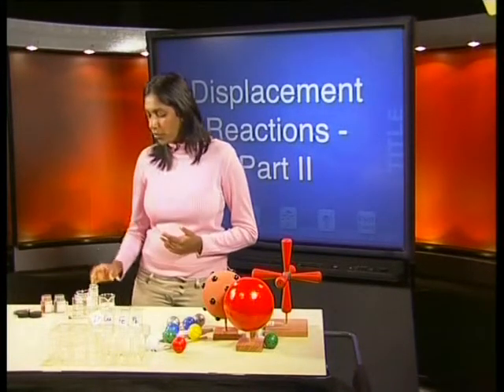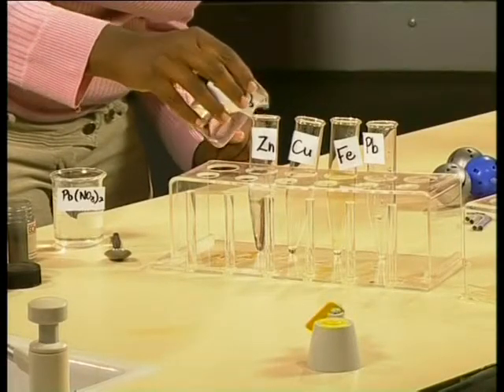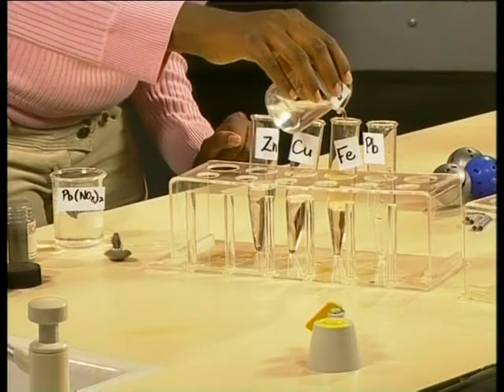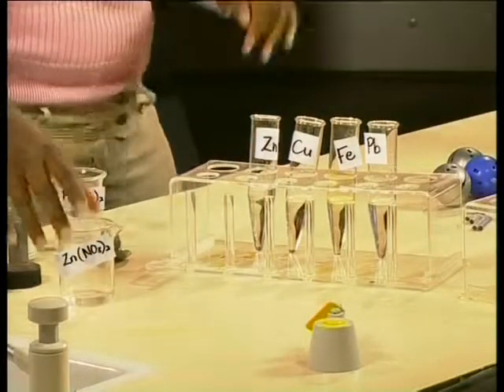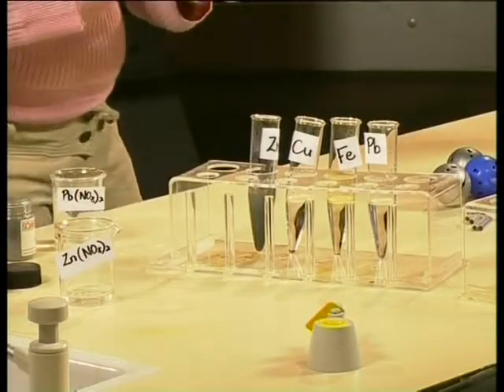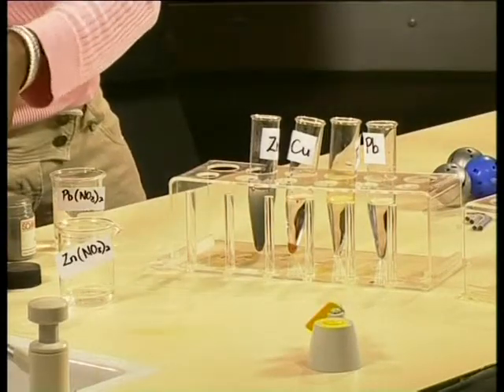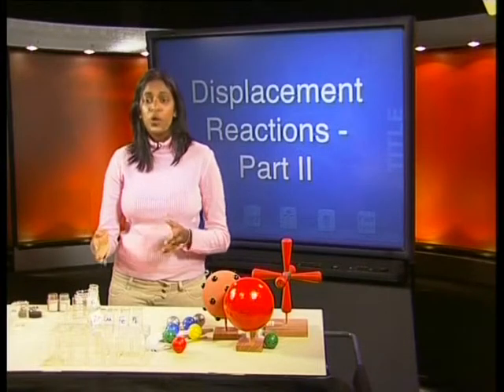Right, let's prepare our experiments. Like before, we pour the zinc nitrate solution into 4 separate test tubes, and add a piece of solid metal to each test tube. Remember to label the tubes so that we can remember which is which.